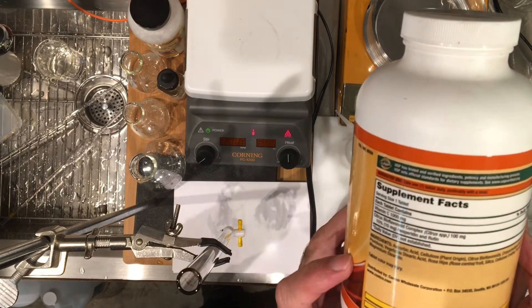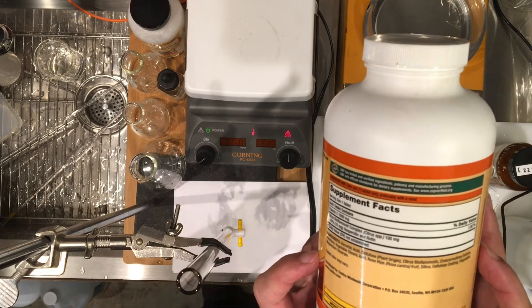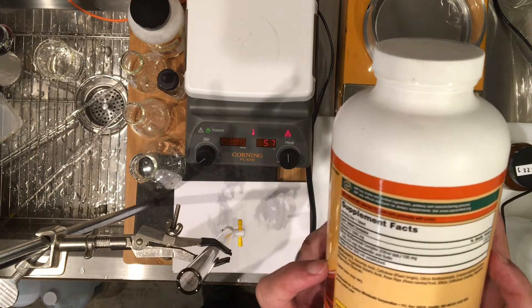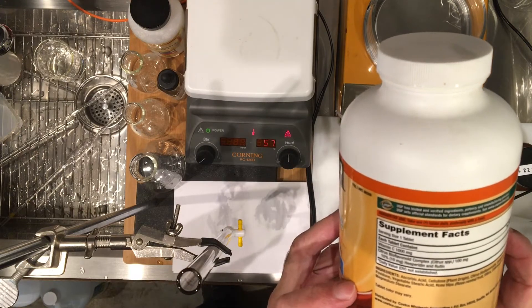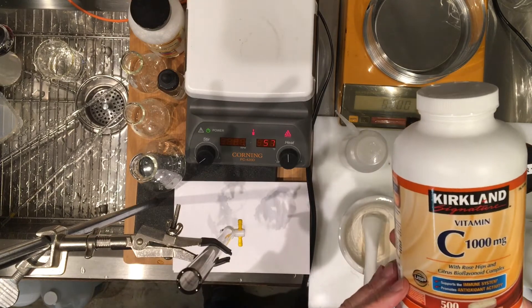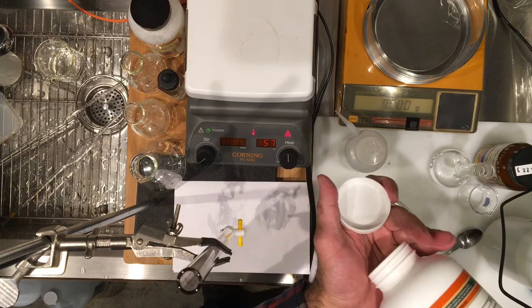In addition to ascorbic acid, it has cellulose, citrus bioflavonoid, stearic acid, silica, vegetable magnesium stearate, and all of that. So it's not pure ascorbic acid. The tablets are roughly one and a half grams a piece.